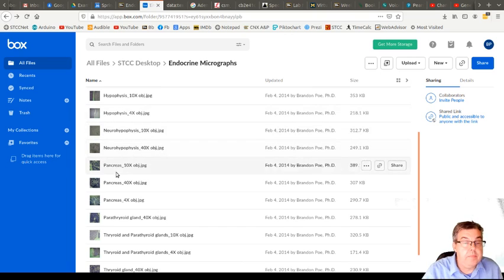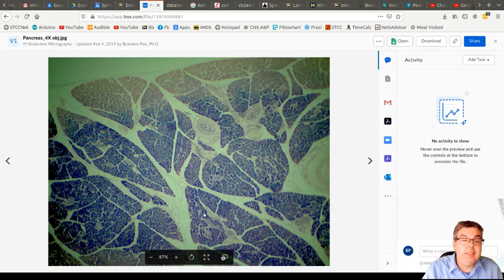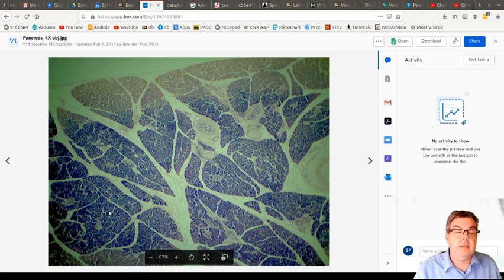All right, now I want to look at the pancreas. So this is not the most beautiful section. It fades off to the top and it fades off to the bottom, and that's because it's an old slide and it's just been damaged by light over the years of students looking at these in the microscope. But most of what we see in the pancreas is dark staining tissue. And actually where it fades off from the top here, that's more of this same kind of dark staining tissue. But then there are these small islands of tissue which stain lighter, and they're called pancreatic islets.